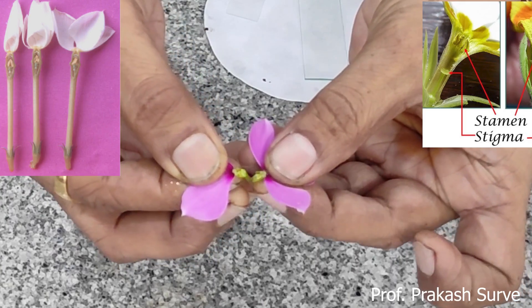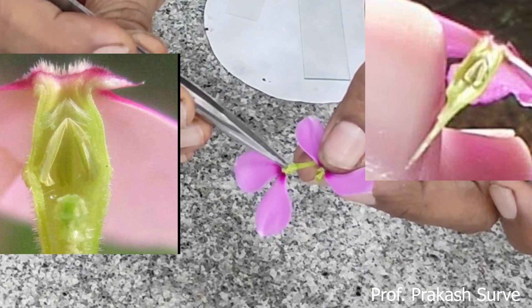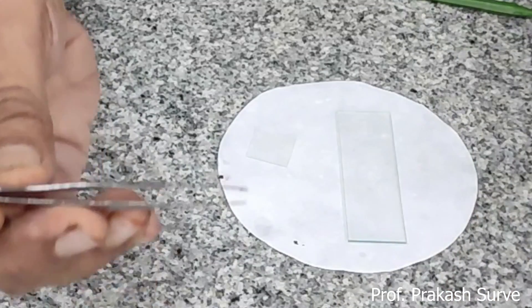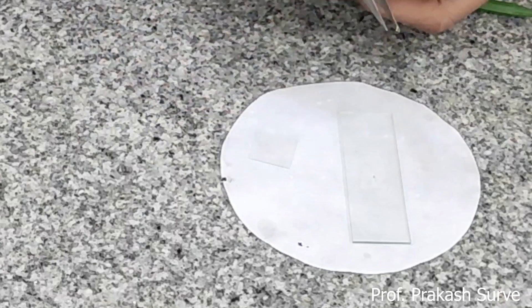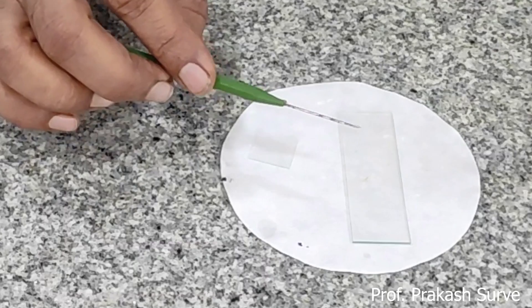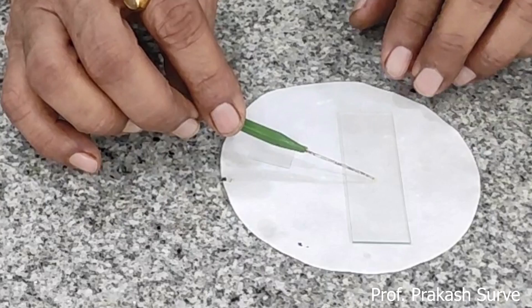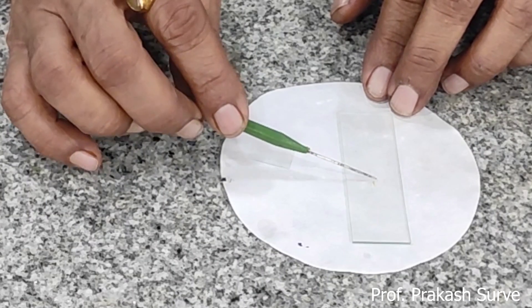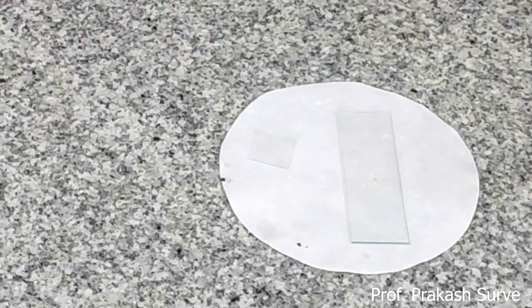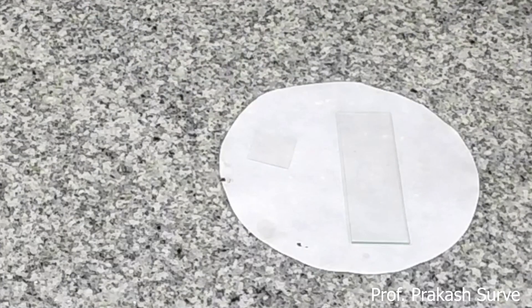Hold the flower at the center, take the whole petals and just pull them away from one another. At the center you will find four anthers — take out one of the anthers and put it on the slide in the sugar solution. Try to open the anther so that all pollen grains come out. The pollen grains will release from the anther; remove the wall of the anther.